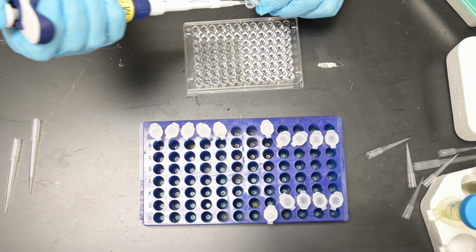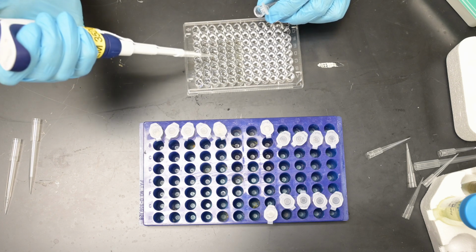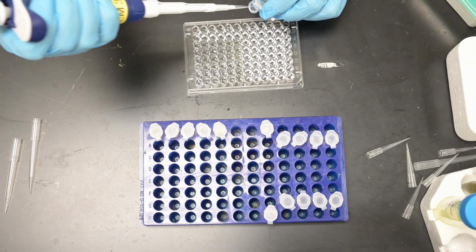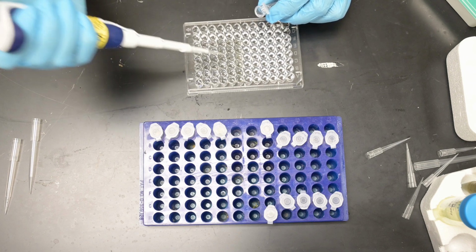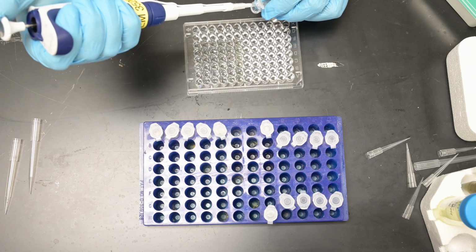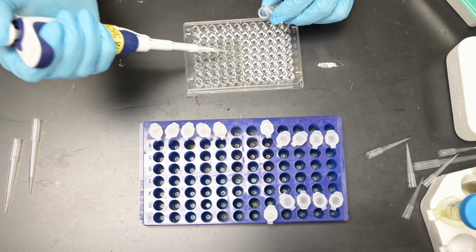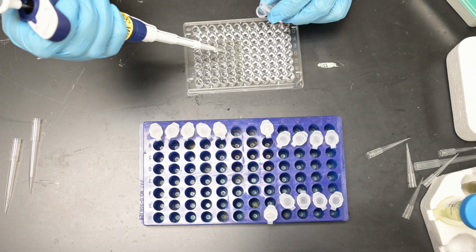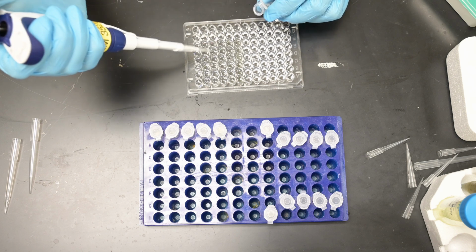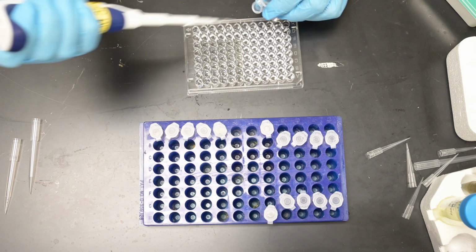We're actually isolating very little enzyme, and in this case, that's why we're having to do reactions that are 20 minutes long. Normally, if you have a lot of enzyme activity, you'd be doing these over maybe 5 minutes, and you'd have to be more careful about making sure the enzyme and substrate work together for exactly the same length of time and doing a timed reaction.